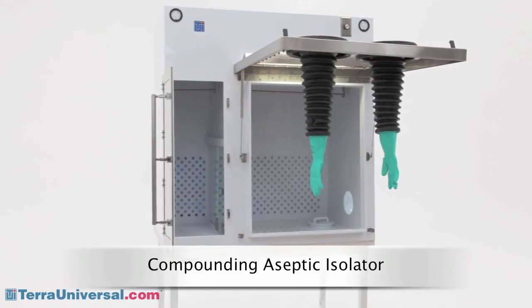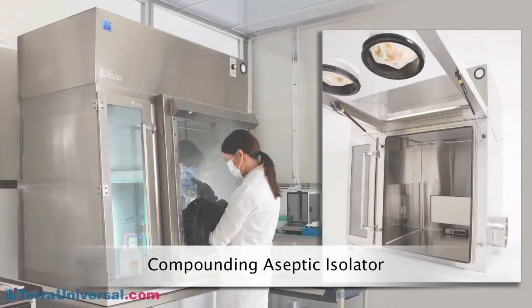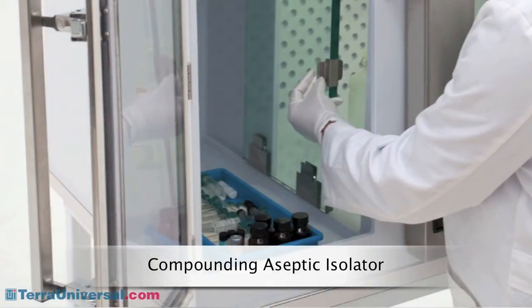Recirculating laminar flow systems are also available. The compounding aseptic isolator shown here, which is designed to meet the specifications of USP 797 for compounding pharmacies, includes a pressure-controlled anti-chamber that allows parts to be transferred in and out of the enclosure without introducing contaminants into the main processing chamber.